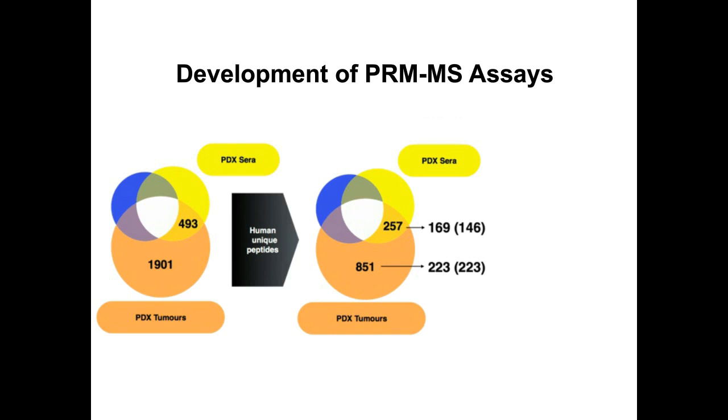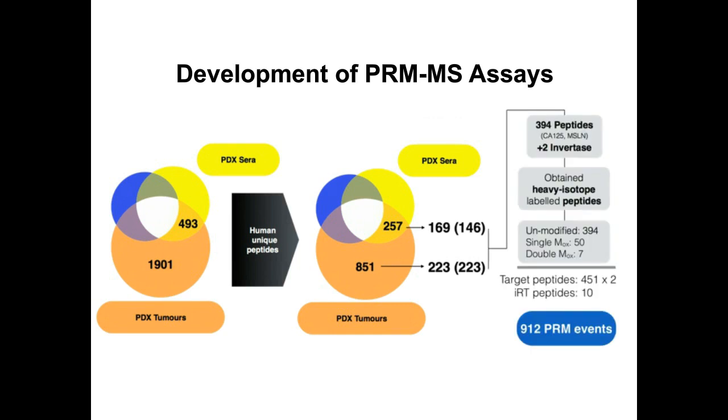We added 2 invertase peptides that we also synthesized as stable isotope labeled peptides. So this goes back to our internal quality control. These were synthesized as bulk stable isotope labeled unpurified peptides. So that's somewhat financially reasonable. One could do AQUA peptides here, but would be extremely expensive.